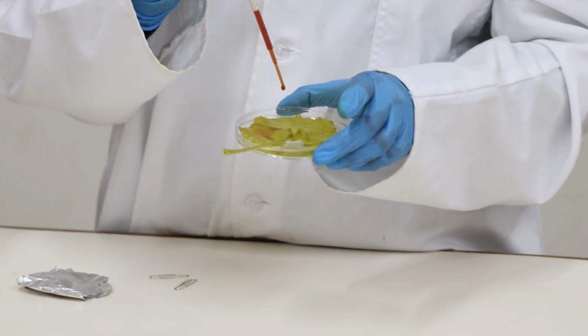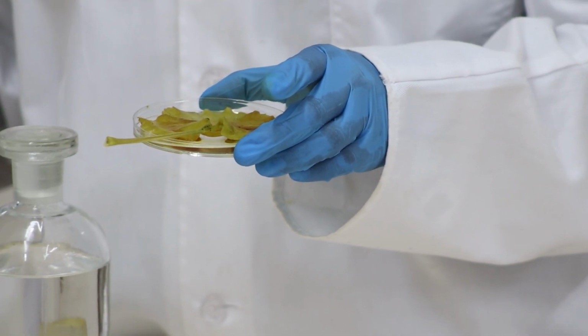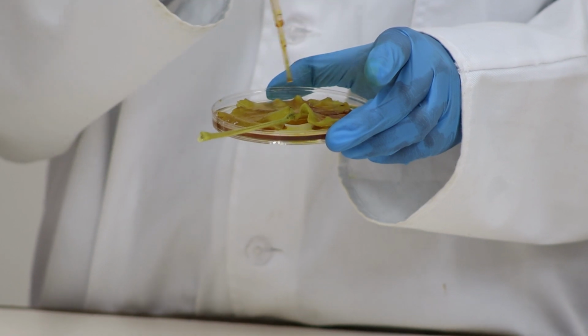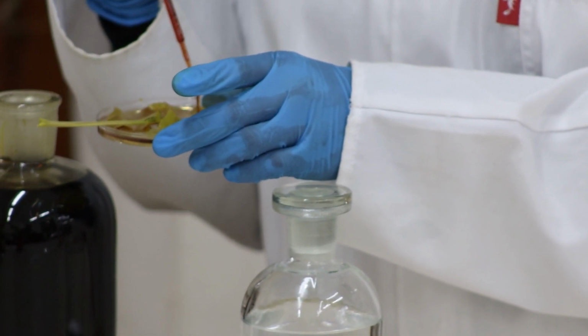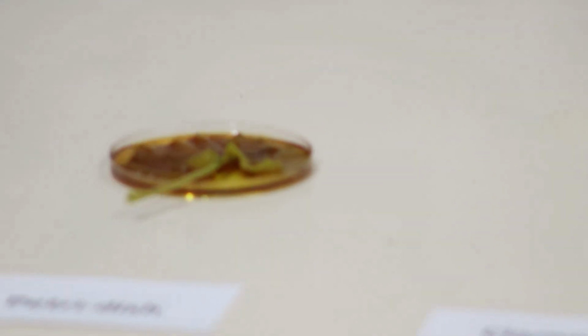So using this pipette, we're just going to drop some of the iodine solution over our leaf. And we will let that develop for 2 minutes and then observe any color changes.